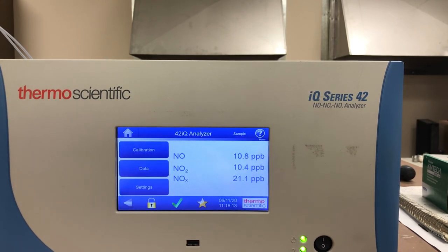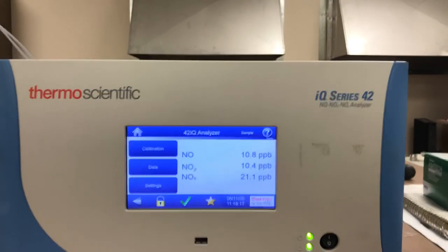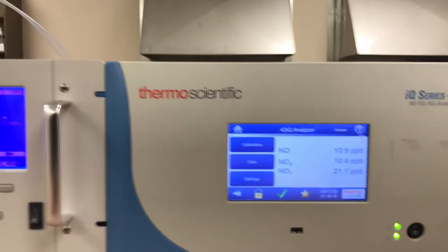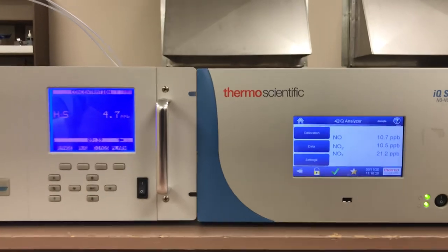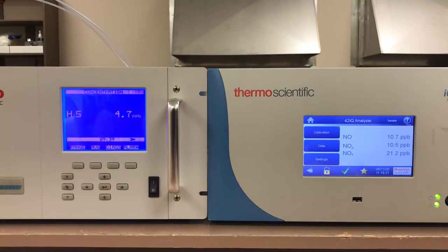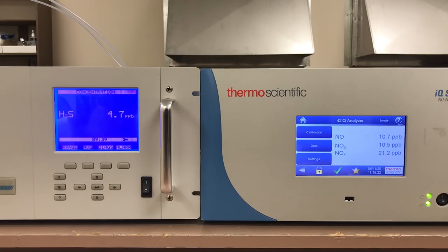So that covers a few of the quick differences between the i-Q and the i-series. If you have any questions, please feel free to comment. Thank you.